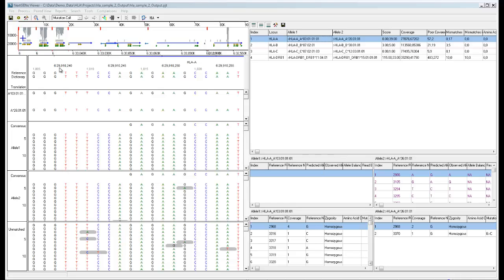Below that is the reference and dictionary pane, which shows the reference sequence, the sequence from the GenBank file, and the dictionary sequence from the dictionary file.